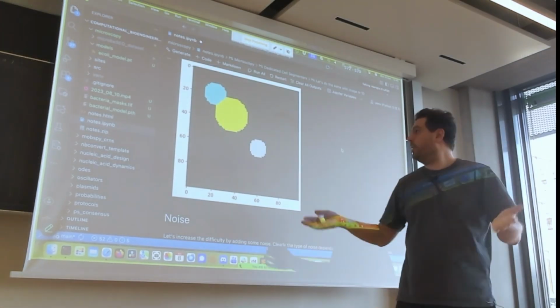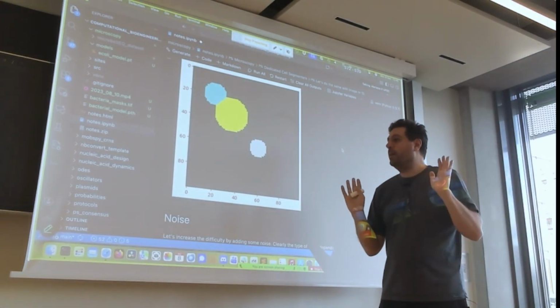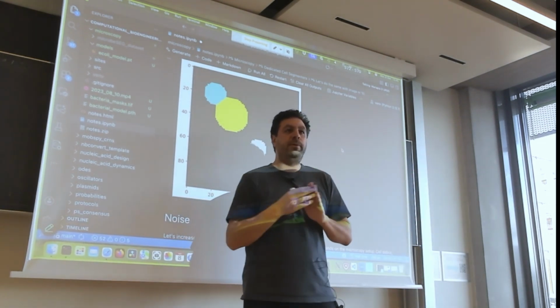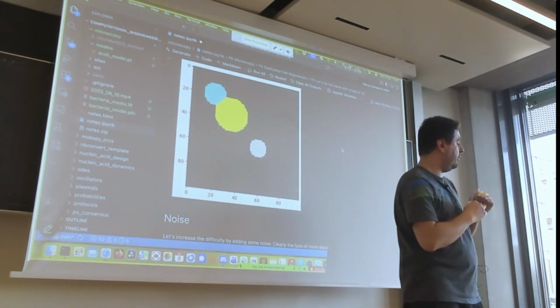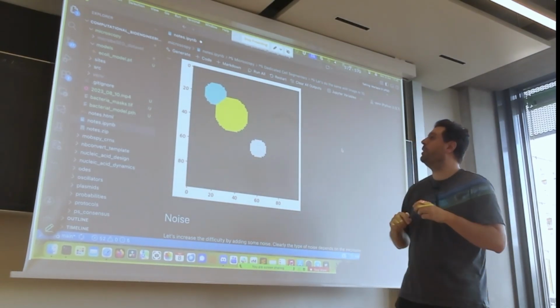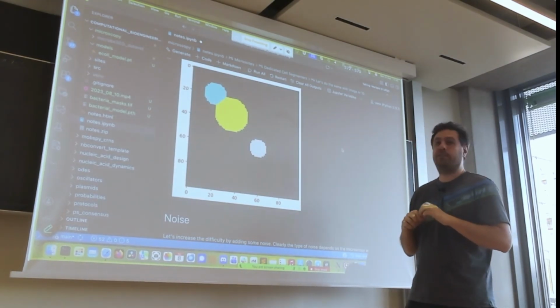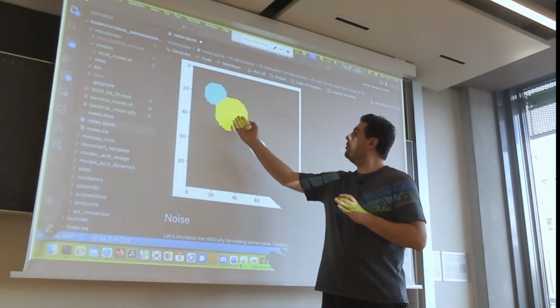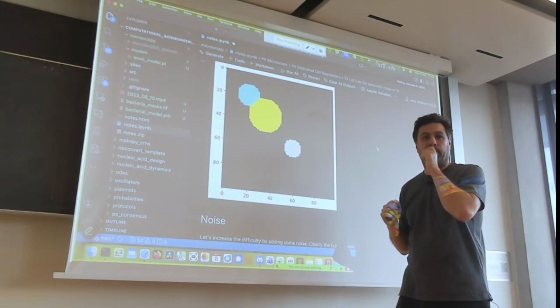Like we will not go into details, and there are many improvements of this algorithm and also shortcomings. It had been improved, but it's such a prototypical algorithm, I think, that it's worth noting it here. This gives a very nice segmentation of such touching objects, right? Because it actually could separate these two touching objects here. Yeah?